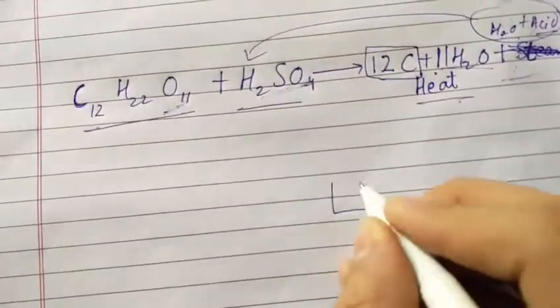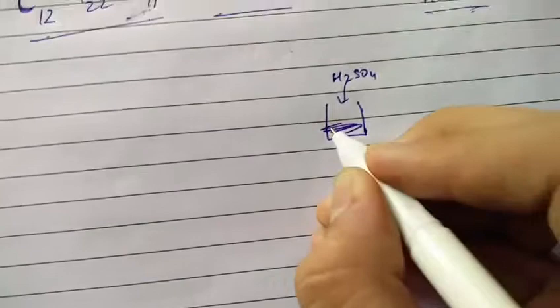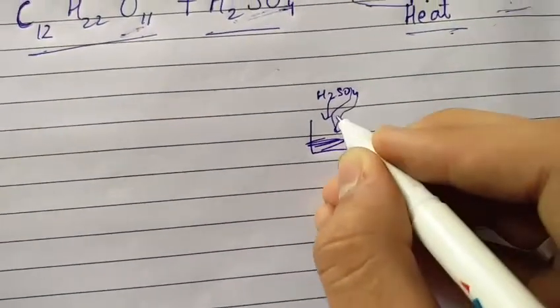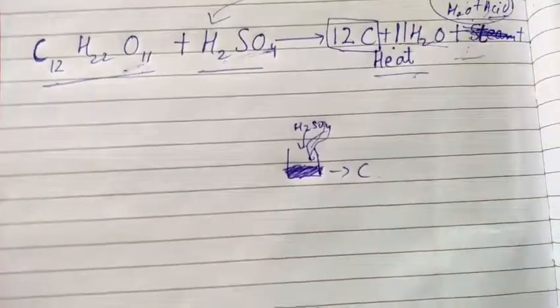Guys be careful, it releases some smoke as you can see and that is not good for your health. Now I'm gonna step back from it and put some baking soda water on it to neutralize the acid. And what you got to say, that is cool.